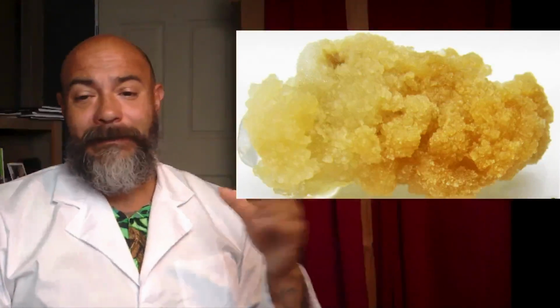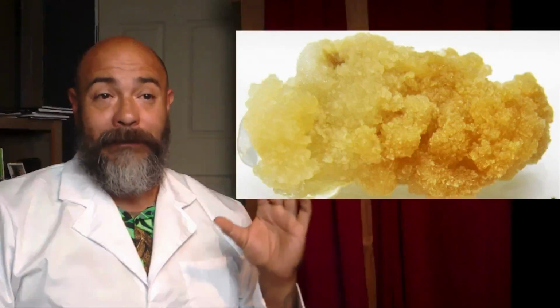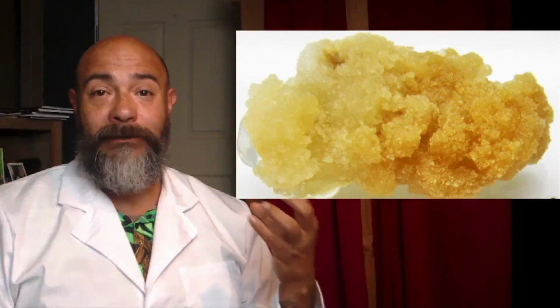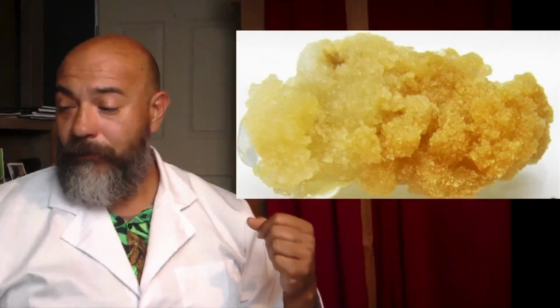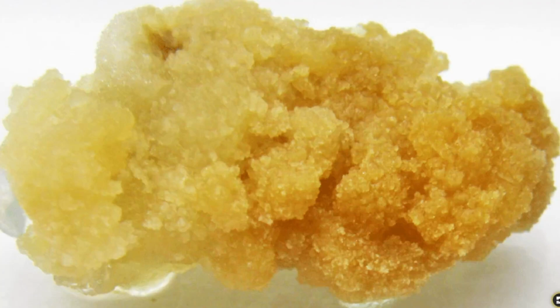So this is on screen. Here is a photo of a large mass of the tissue, so you can get a better idea of what it looks like up close. And let's go to a full screen view of that. There you are. As you can see, it's just a mass of cells that are compacted together there in one lump. It almost resembles earwax or even a mineral from the ground. It's very similar.